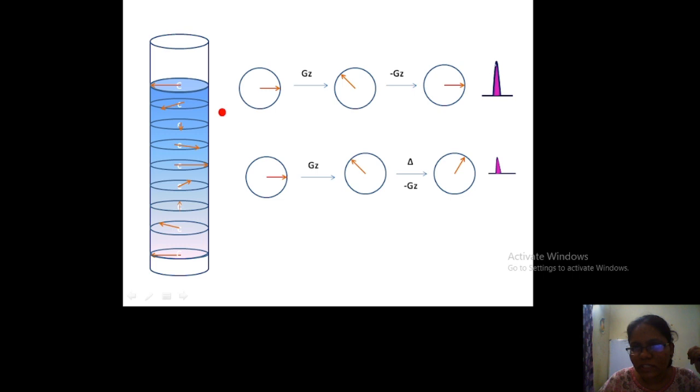Okay. So this intensity of the signal is detected by the detector which is present in this direction, the x direction. If this magnetization vector is completely along x, and M is the magnitude of the magnetization vector, since it is completely along x, it makes 0 angle with the x-axis. The component of the magnetization vector along the x-axis is given by M cos theta. So this theta is 0, and M cos 0 will be M. So the signal intensity will be maximum, which is M.